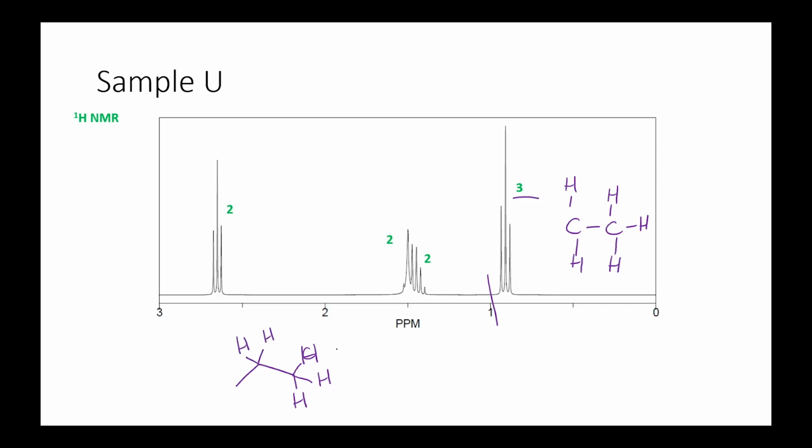The next thing I need to do is to have a look for where my amine might be. So the fact that we have populated half of our molecule already indicates that my amine is probably going to be on the last carbon. So it's going to be a terminal amine.